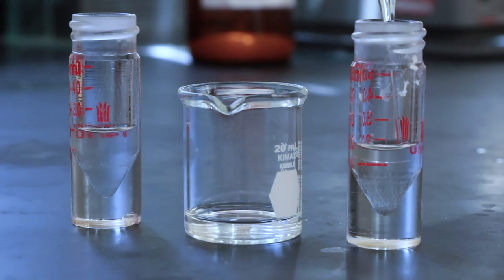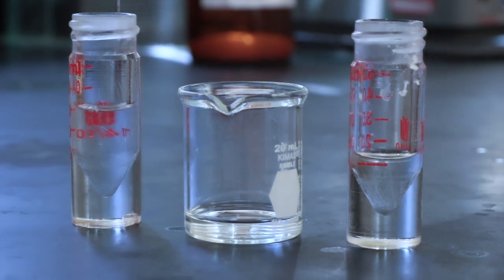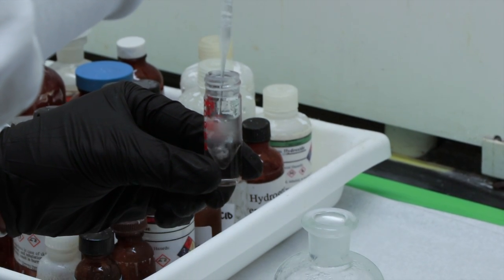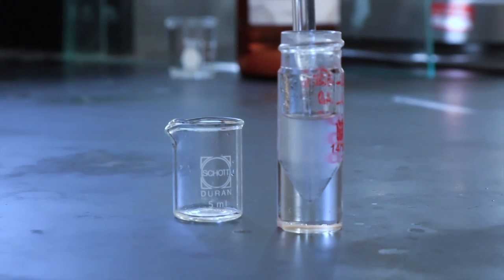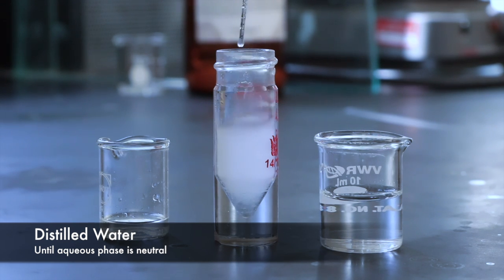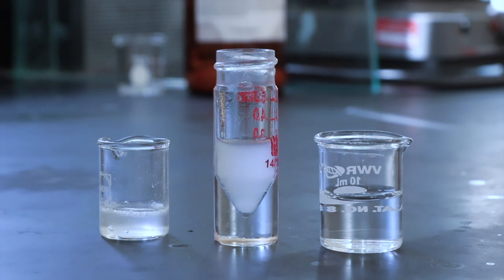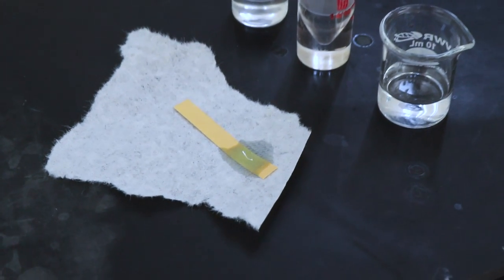This time I added some distilled water so we could see the layers a little bit better. I'll rinse the combined ether extracts with some HCl to remove any base that might have gotten moved over along with the organic phase. I'll go ahead and remove that aqueous acid layer and then do multiple washes with some distilled water until the remaining aqueous layer after those washes is neutral to a pH strip. This means that all of the acid has been removed and the aqueous layer is no longer acidic. We're looking for a yellowish green color, so that looks great.